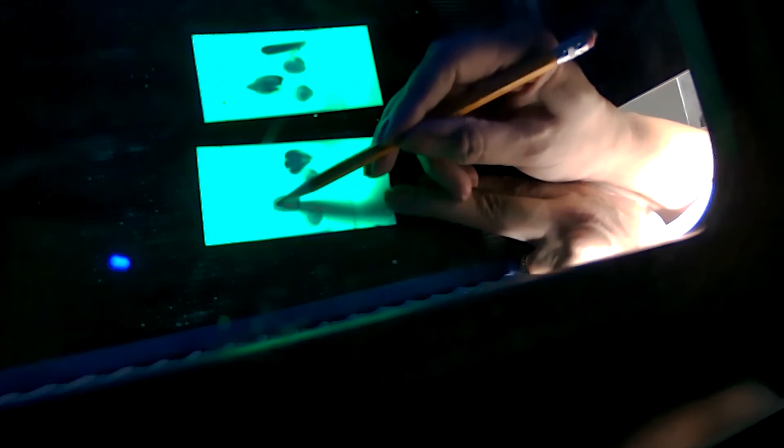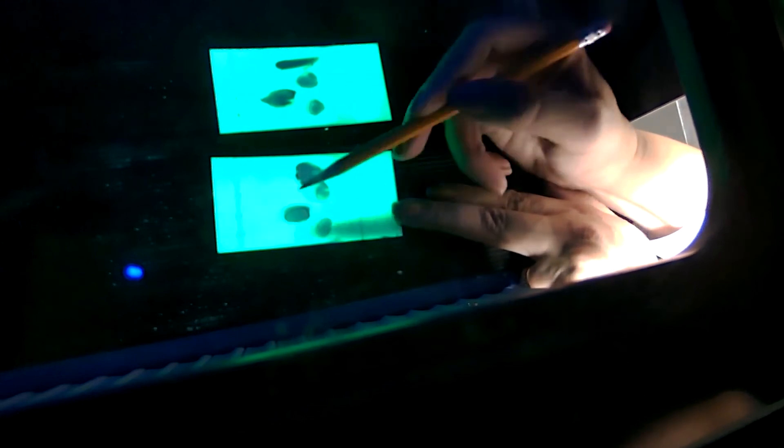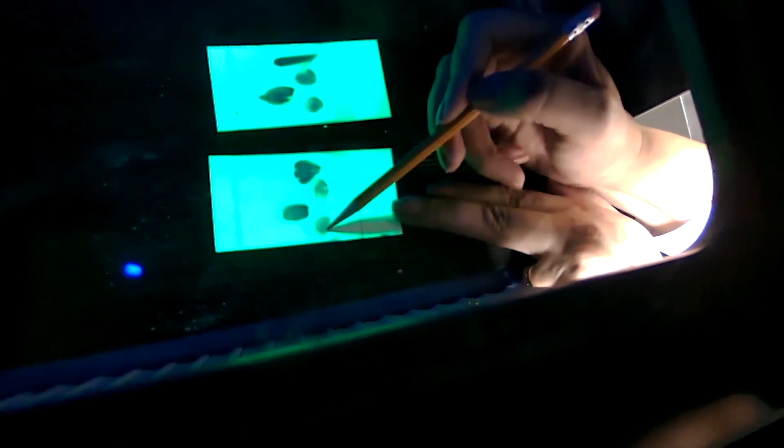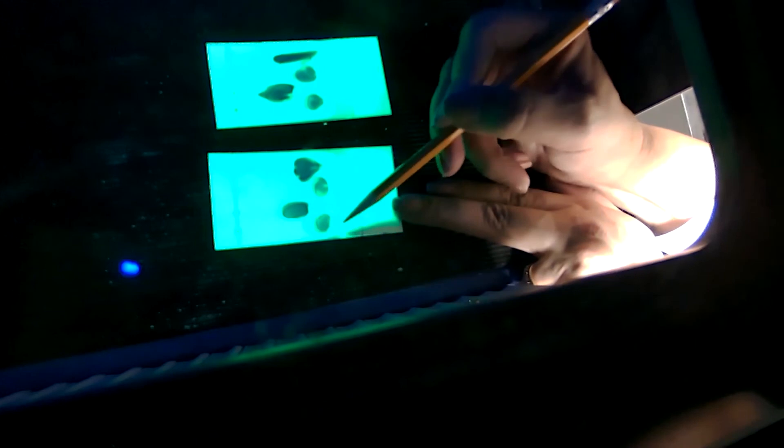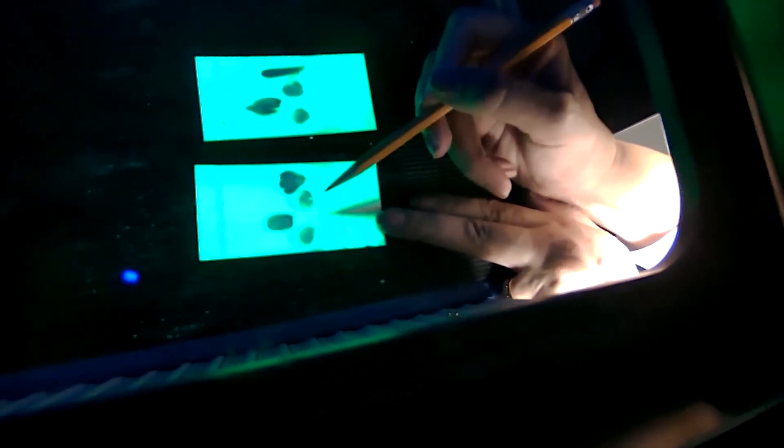So what you are comparing here, how far they traveled. And the unknown is the last spot. It's very obvious that this unknown now is very similar to sample two, and then based on the diagram you can say what your unknown is.